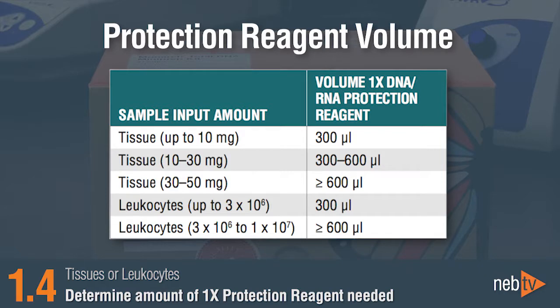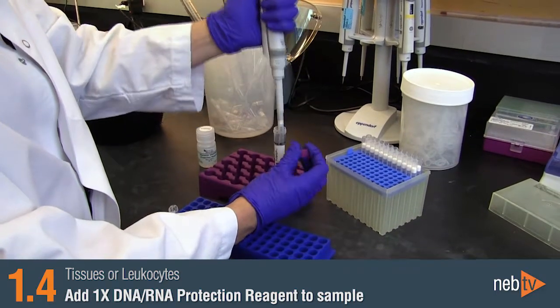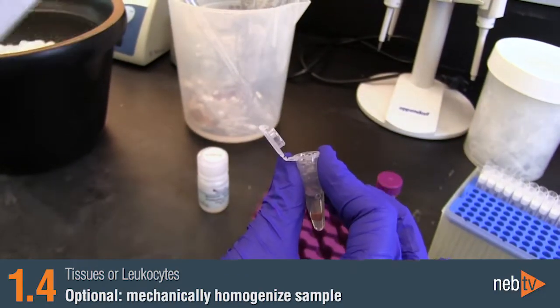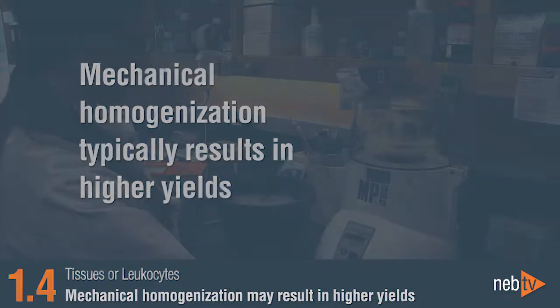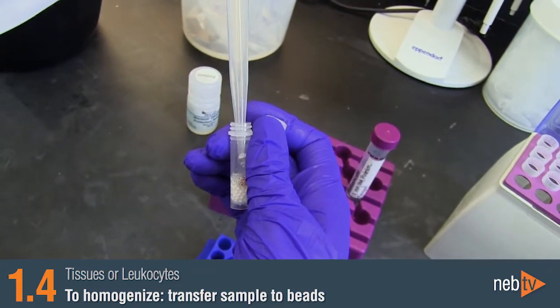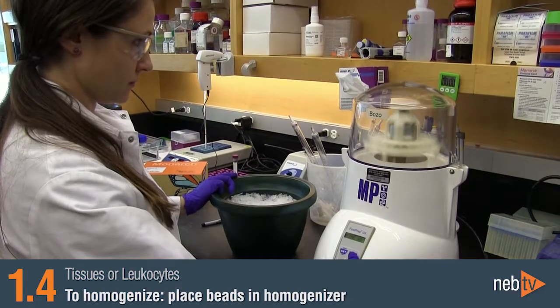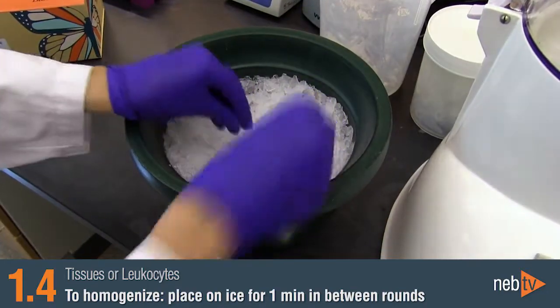First, determine the amount of 1x DNA and RNA protection reagent needed and prepare it by diluting an aliquot of the 2x concentrate with nuclease-free water. Add the appropriate amount of 1x DNA-RNA protection reagent to your sample. At this point, the sample may either be digested with Proteinase K directly, or the sample can be mechanically homogenized with a bead homogenizer prior to Proteinase K digestion. Mechanical homogenization typically results in higher yields. For mechanical homogenization, transfer the sample in the DNA-RNA protection reagent to an appropriate tube containing beads, and place in a bead homogenizer. If multiple rounds are required, place the sample on ice for approximately 1 minute between rounds to prevent overheating.